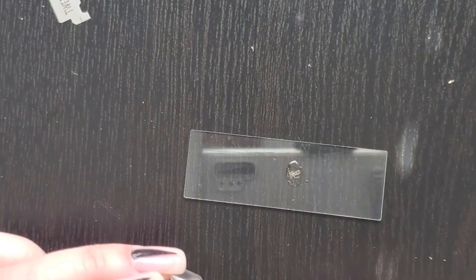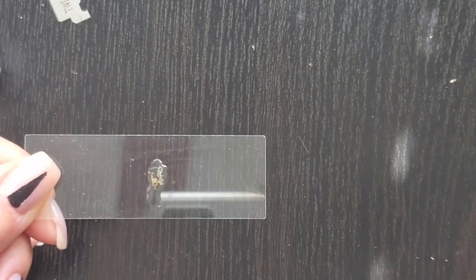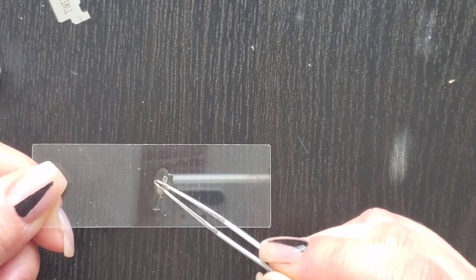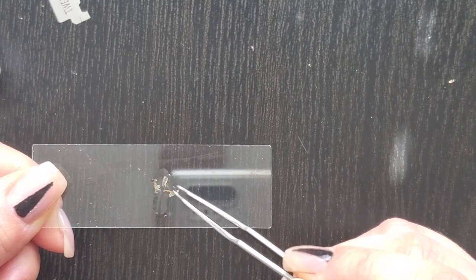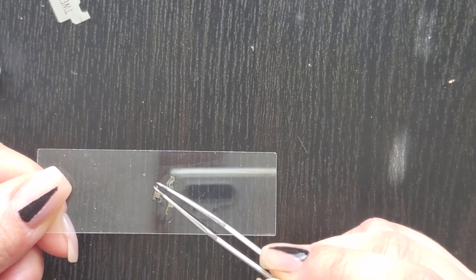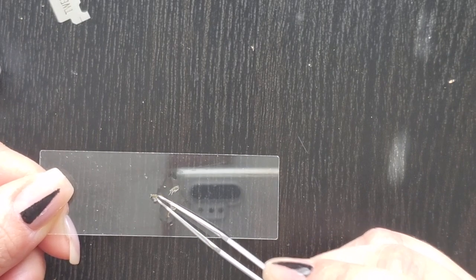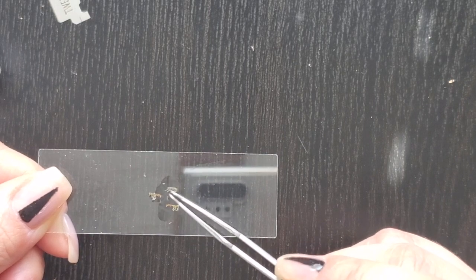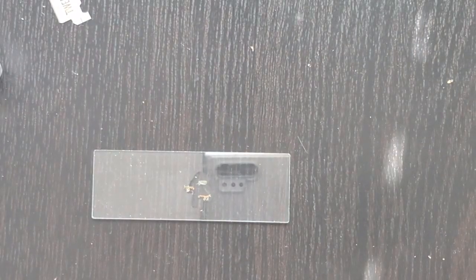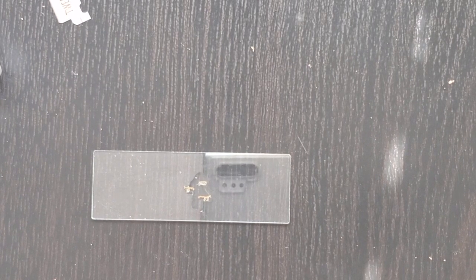Out of the camera because I have to get really close to see the pieces that I want. Okay. All right, so this should be a little bit more in focus. And what I'm trying to do is to separate these somewhat from each other for when I put the cover slip. They're all arranged in the same way. So put it like this and then place the cover slip. Which I should have.